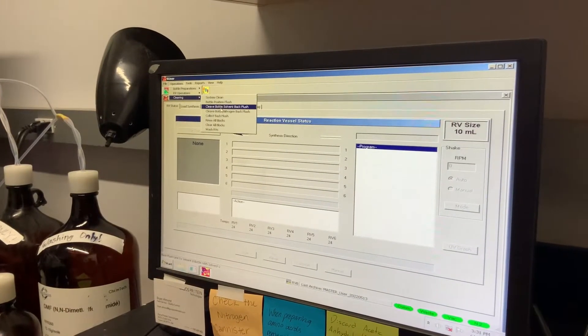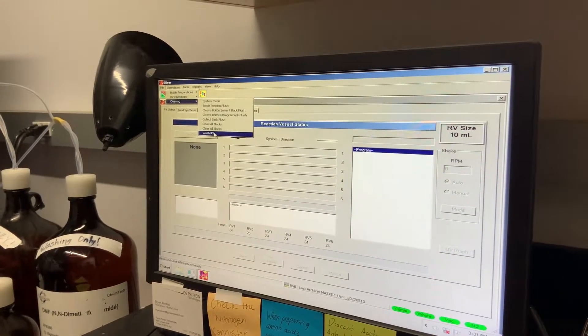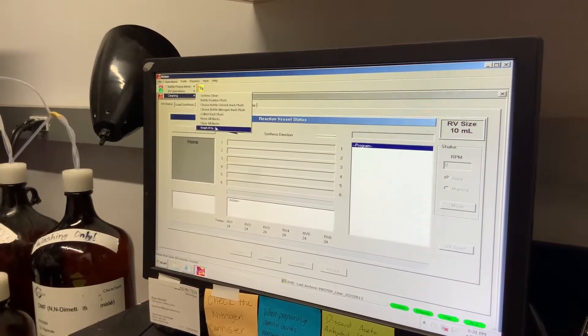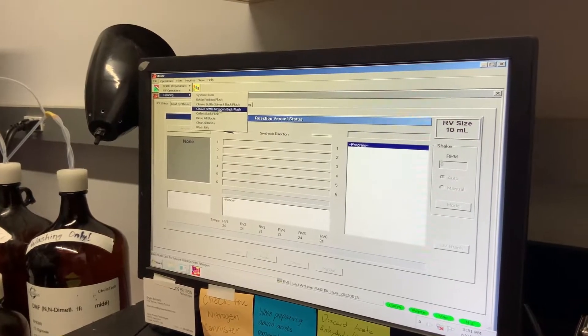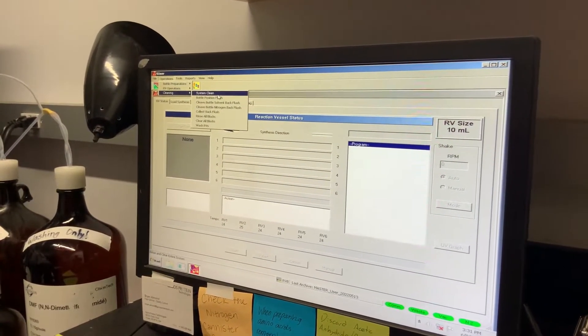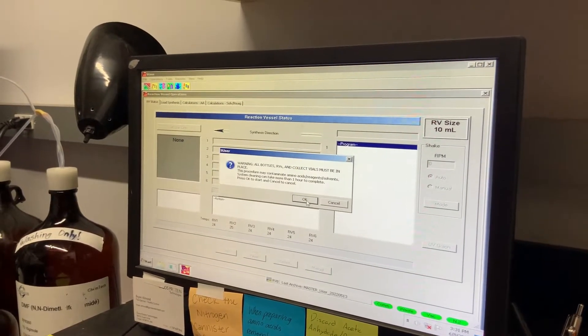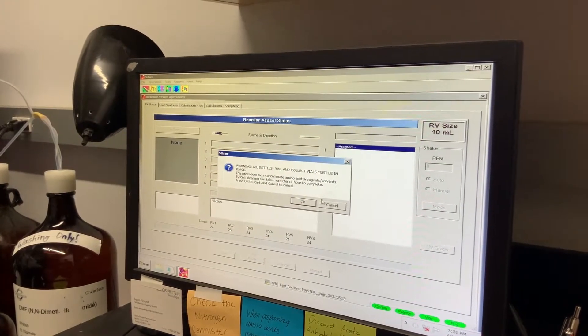Under Operations, under Cleaning, select System Clean. Normally after a synthesis you would wash the reaction vessels and run a nitrogen back flush. The system clean program, however, runs those steps in addition to the rest of the programs listed underneath it to make a very thorough clean. When this program is selected, it will automatically begin pressurizing the system and running the cleaning steps.